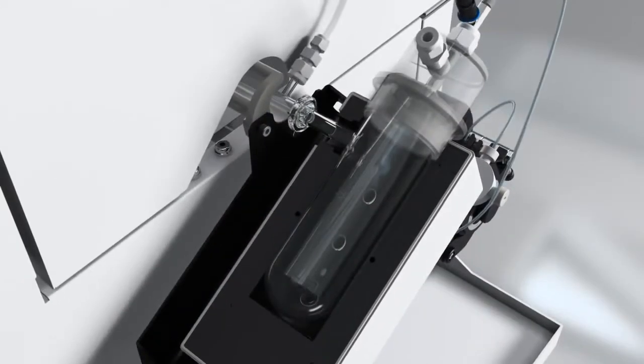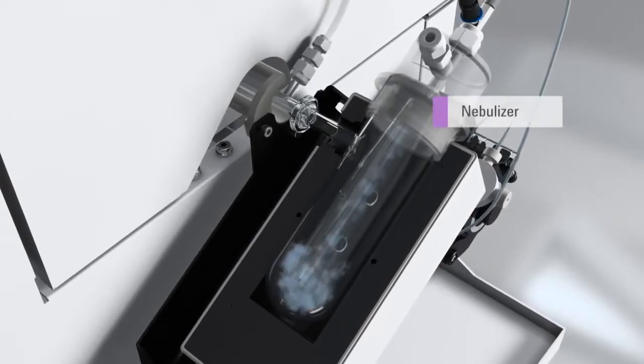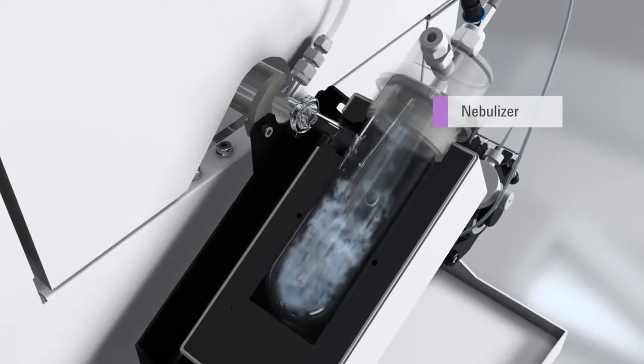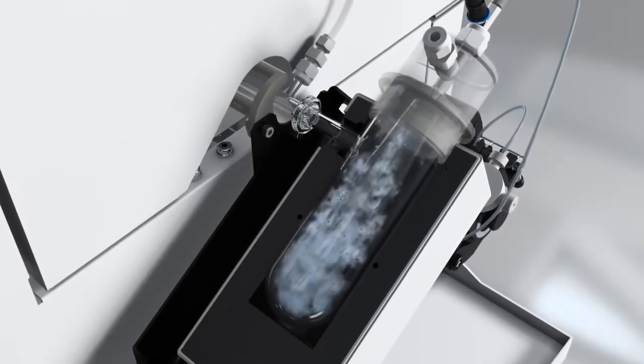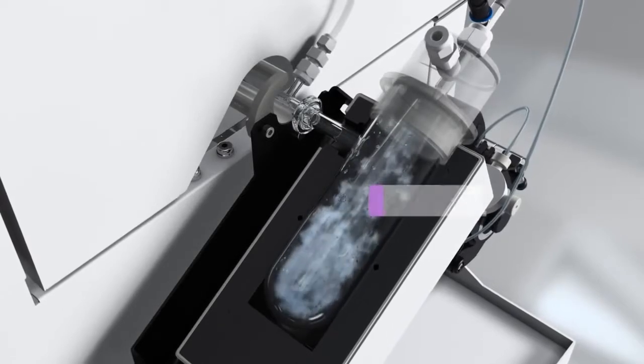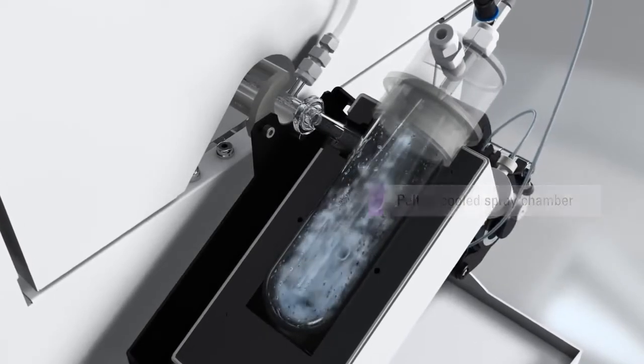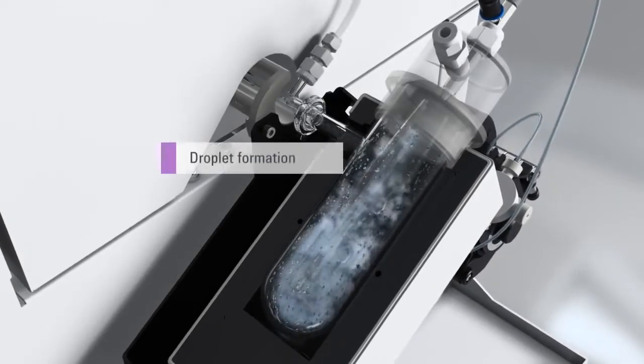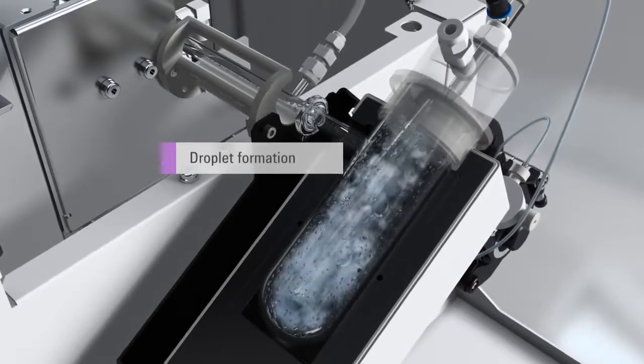The sample is introduced into one of Agilent Technology's specially designed low-flow nebulizers, where it mixes with argon gas to form a fine aerosol. The aerosol passes through the double-pass Peltier cooled spray chamber, where the larger droplets are removed to increase plasma robustness. The small aerosol droplets leave the spray chamber and enter the transfer tube leading to the plasma.